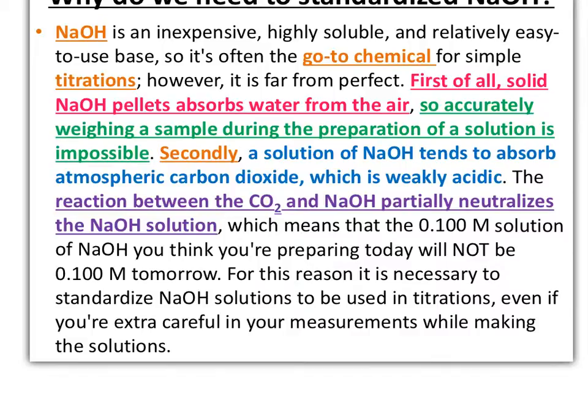So if I did a lab in second period and it was 0.1, what are the chances of it still being 0.1 in sixth period? 0%. So it's going to change. For this reason, it is necessary to standardize NaOH solution to be used in titrations, even if you're extra careful in your measurements while making these solutions.